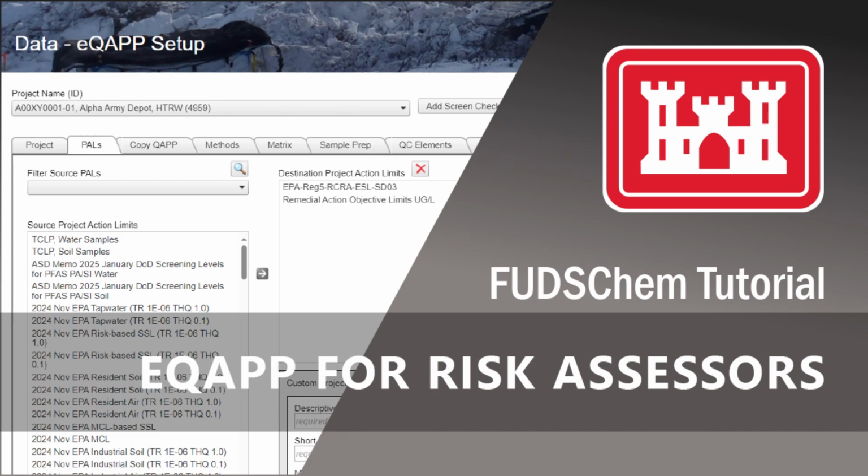This video will go over what a risk assessor needs to know about the eQAPP in FUDSChem. It's important to ensure that incoming data meets project objectives. To do so, FUDSChem allows the UFP QAPP to be digitized into an electronic QAPP, or eQAPP.